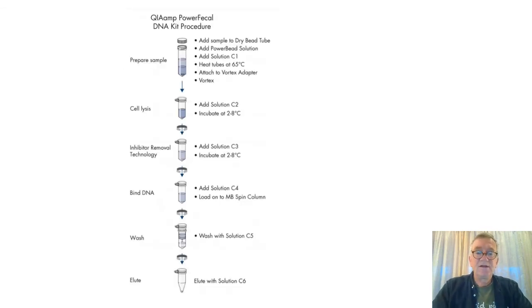This is the procedure that you will follow for isolating DNA from your sample. You collect the sample from the laboratory bench and you isolate DNA by using this kit, the PowerFecal DNA kit. It's designed for isolation of DNA from stool or feces, which is a mixture of a lot of microorganisms, but also some other material that might influence your samples.